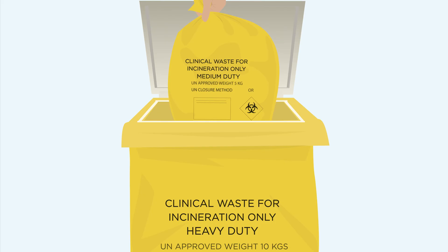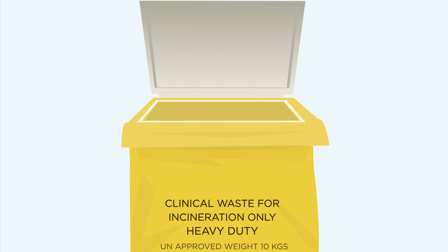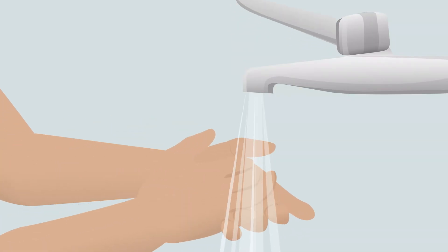Close bag ensuring you do not touch the inside. Tie a knot and place bag into appropriate waste stream in accordance with local regulations. Wash hands thoroughly.